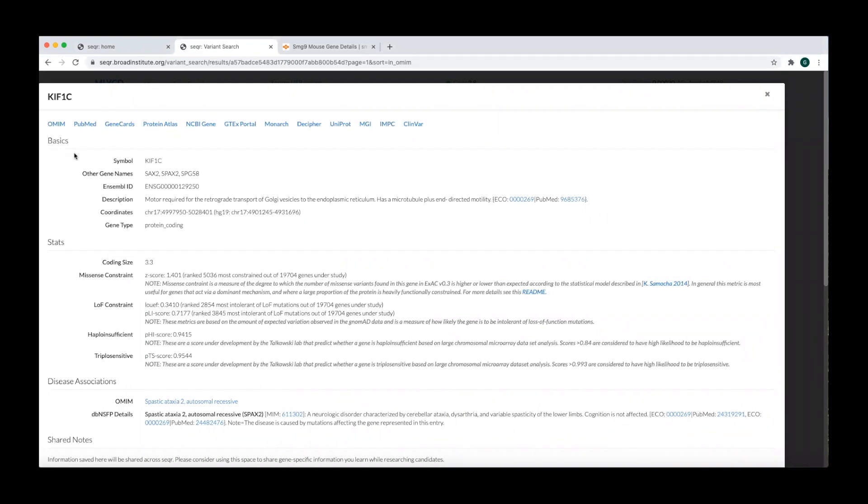In the basics section, you can see any alternative gene names, genomic coordinates, and a brief description of the gene and its function.